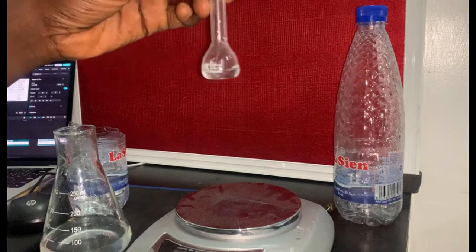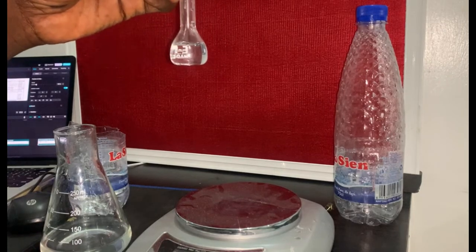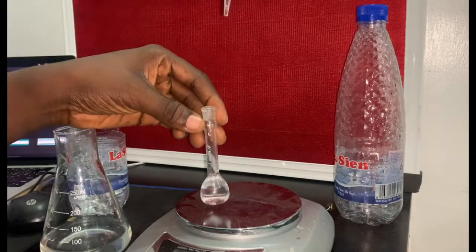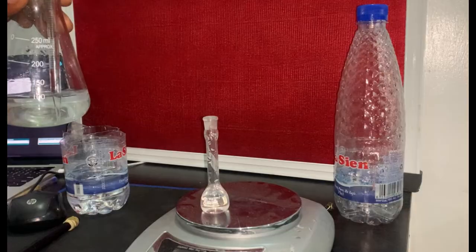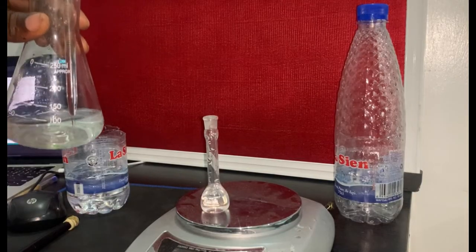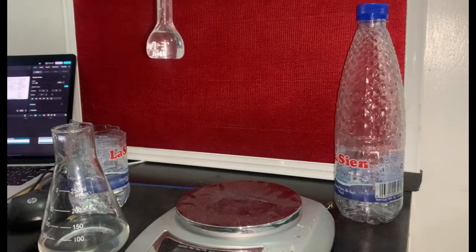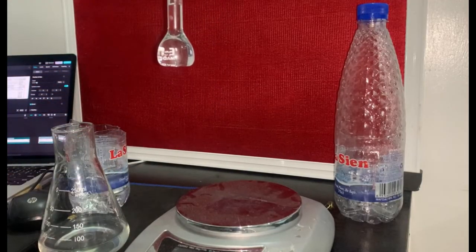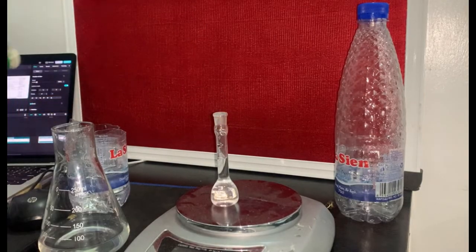Why are we using these volumetric flasks? Recall that we know the volume of these flasks to be 10 ml, and we know the mass of these flasks to be 16.5. So if I take the mixture and put it inside these flasks up to the calibrated points, I'm certain that the content inside the flask will be 10 ml. Okay, so that I can now use my volume to be 10 ml.